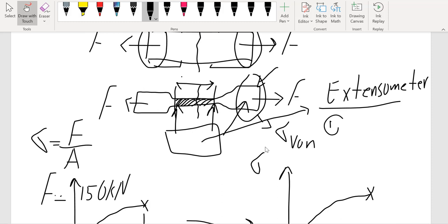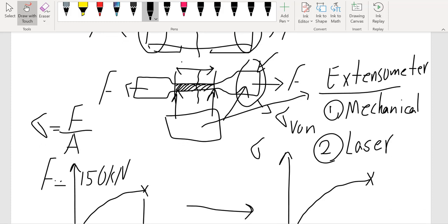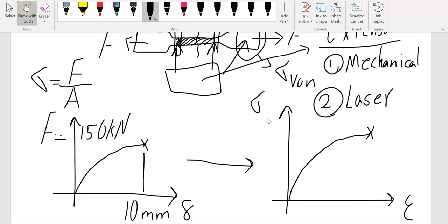Extensometers are either mechanical or laser-based. With a laser extensometer, you wrap a tape at two points on the specimen and use a camera with a laser to detect the movement. We are interested in the displacement at the gauge length specifically. The machine gives us the displacement of the whole specimen, not just the gauge length, which is why we prefer to use an extensometer — it gives a more accurate stress-strain curve.